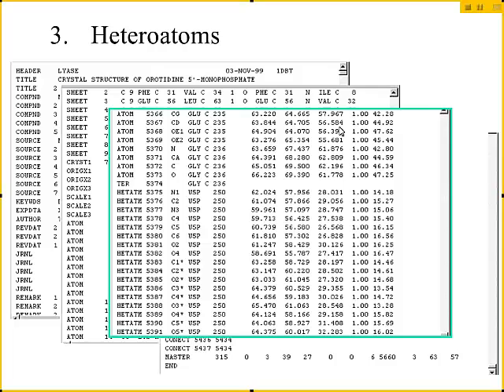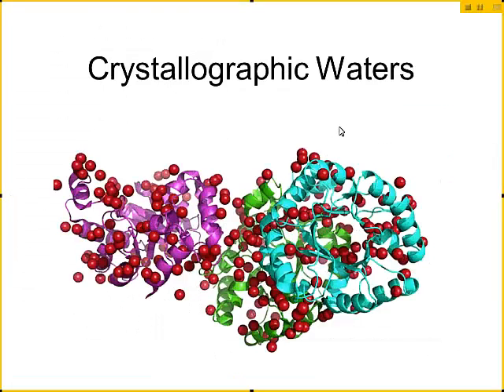So if you look in your header for missing, you'll see which loops or side chains are missing. You can be missing just parts of side chains or the whole residue, including backbone atoms. Now, the other thing you see in this PDB file down near the bottom, if you have non-standard atoms, if you have an organic ligand bound, if you have carbohydrates, if you have a heme group, any prosthetic group like that shows up as het atom or hetero atom.